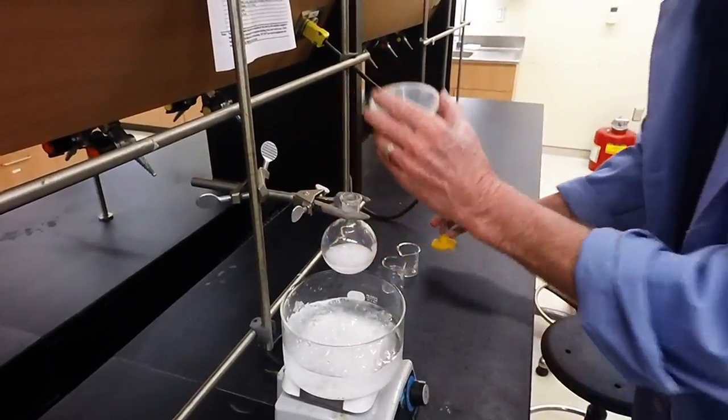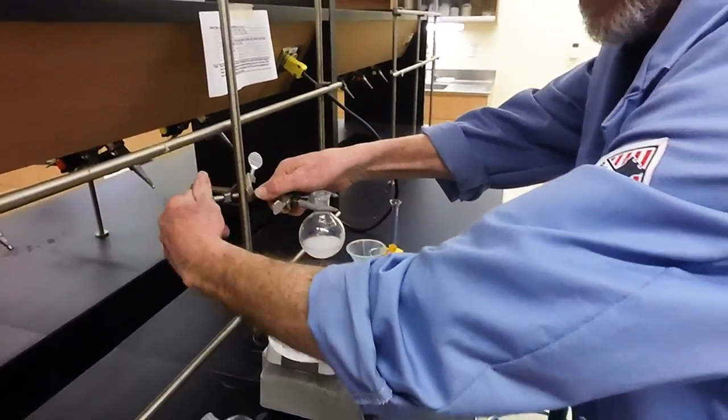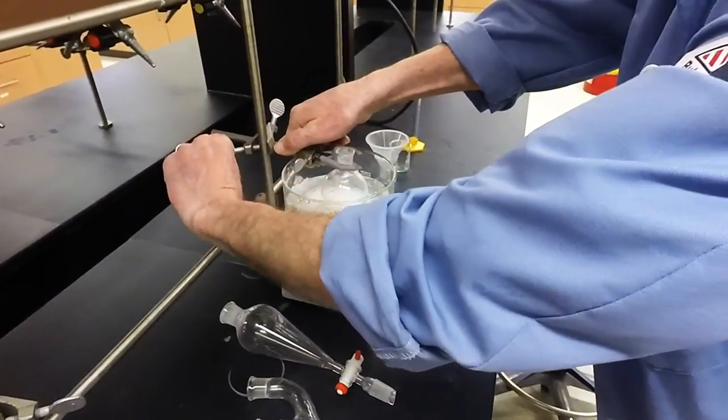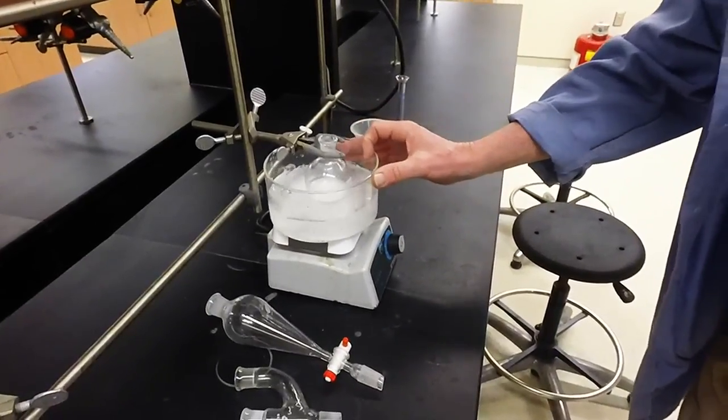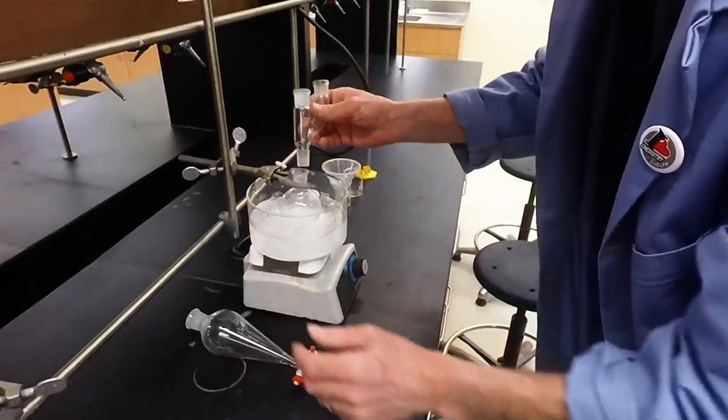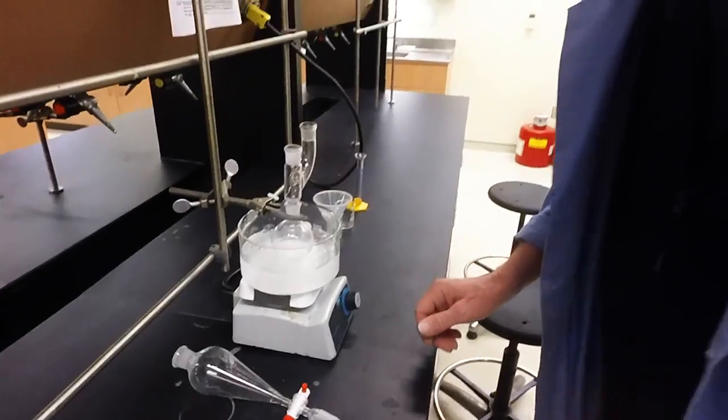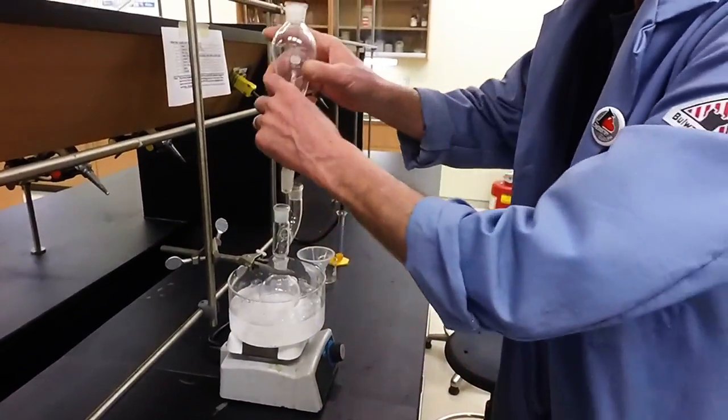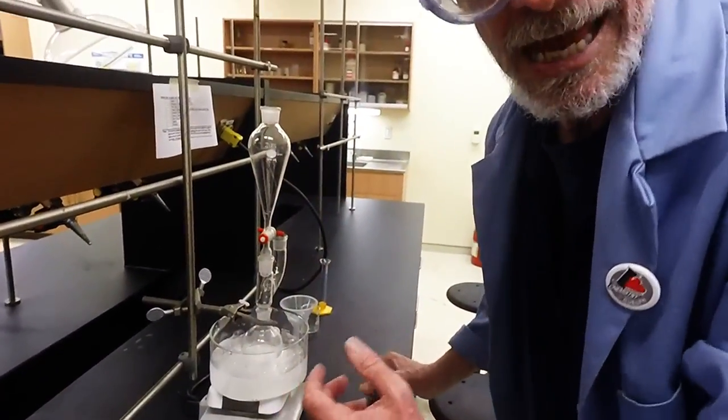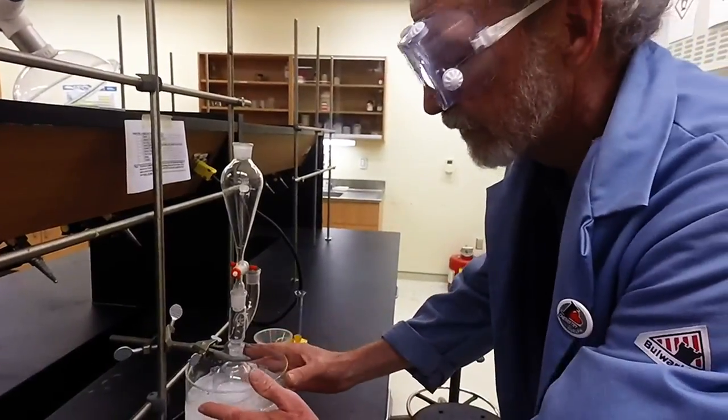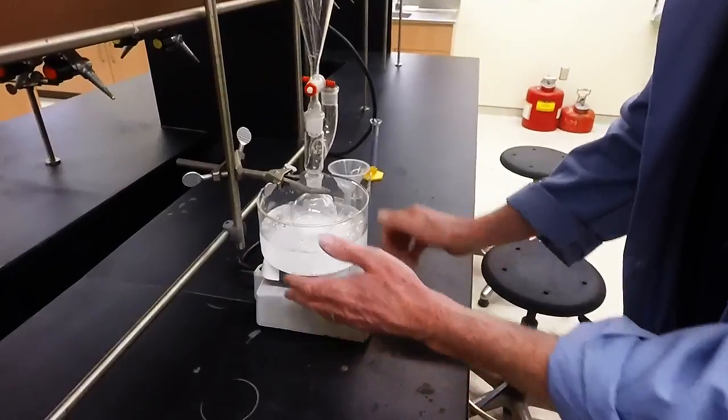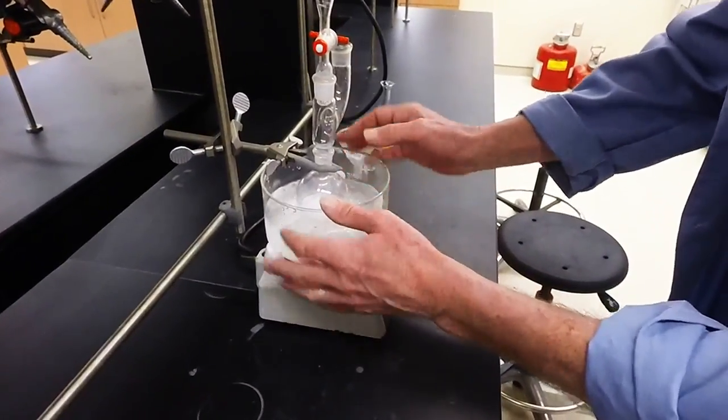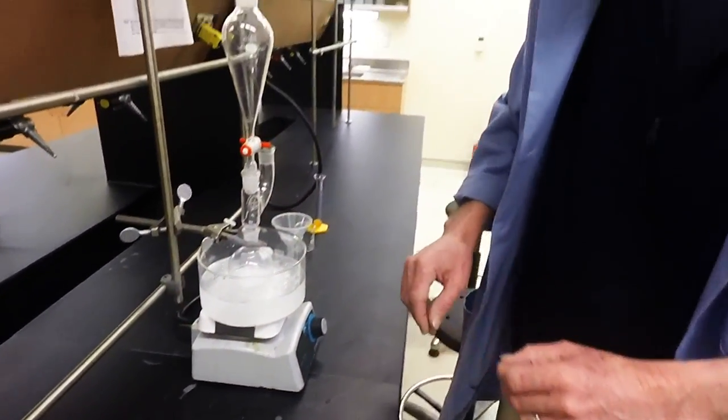So now would be a good time, let's get our ice bath prepared and stirring. Our reaction involves adding sulfuric acid to make it go. Sulfuric acid, when it's added to anything, generates a lot of heat. So cooling, very important. Stirring, not too fast or the stir bar will just dance around. Okay, and so we're ready.